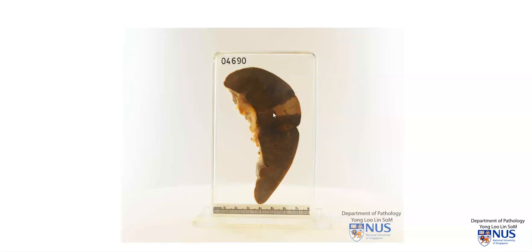In summary, this is an example of a splenic infarct showing a wedge-shaped area of pallor with the base of the wedge abutting the splenic capsule. One of the common causes is thromboemboli.